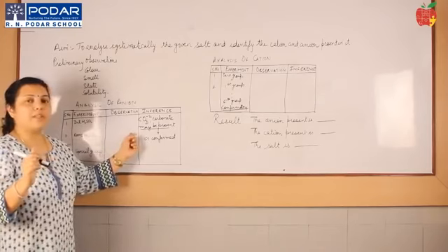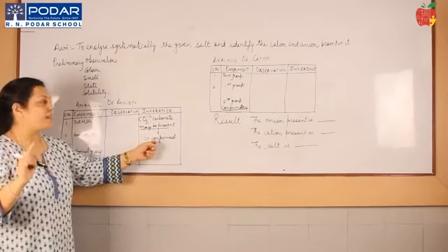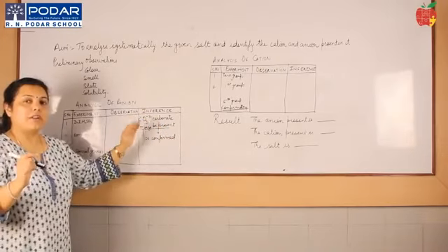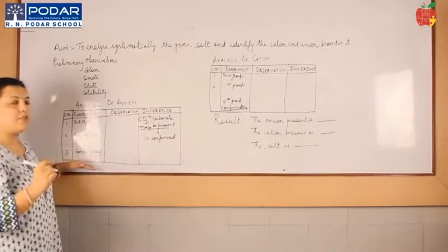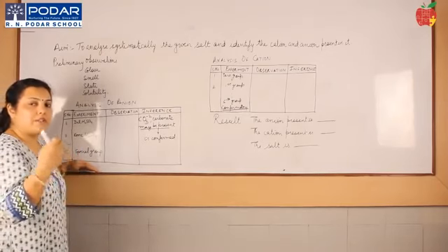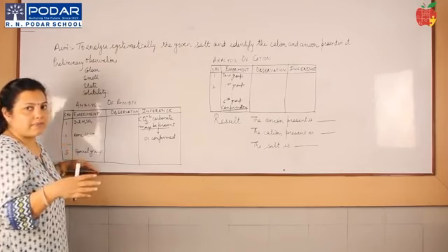So everything will come in the observation, and over here instead of carbonate, the way I have written, you will have chloride may be present. Then when you say chloride may be present, after that no need to write down the special group, just continue with the confirmatory test of chloride. That means your silver nitrate test, your chromyl chloride test.